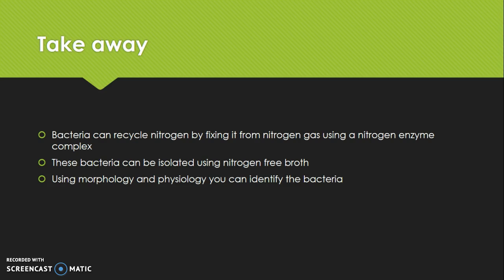So the takeaway here is that bacteria can recycle nitrogen by fixing it and to allow plants to grow and stuff like that. Nitrogen fixation is important more than just growing plants, right? But that's just an easy thing that we can identify with. These bacteria can then be isolated using a nitrogen-free broth and a nitrogen-free plate. And then we can use the morphology and the physiology to identify the bacteria. So it's a really interesting experiment.